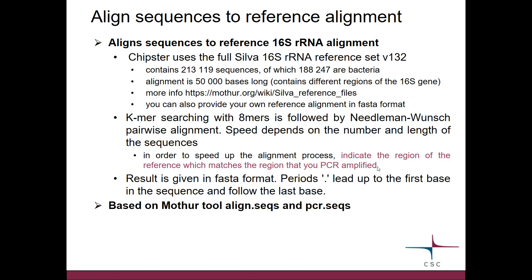If you don't know the coordinates of the V2 region in the reference, you can first align a small set of samples to the full reference alignment. And then once you know the coordinates, do the whole thing using those coordinates and just the subsection of the reference.